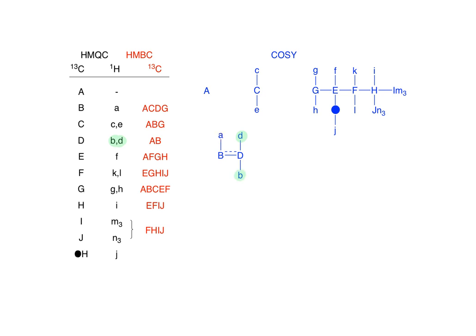Getting back to the HMBC correlation, protons B and D have a 2-bond correlation with carbon B. That confirms what we already knew. We can probably pretty firmly now make this a double bond. But it also shows a correlation from proton B and D to carbon A. This must be a 3-bond correlation. And now we've completely bonded the carbons B and D with 4 bonds total.